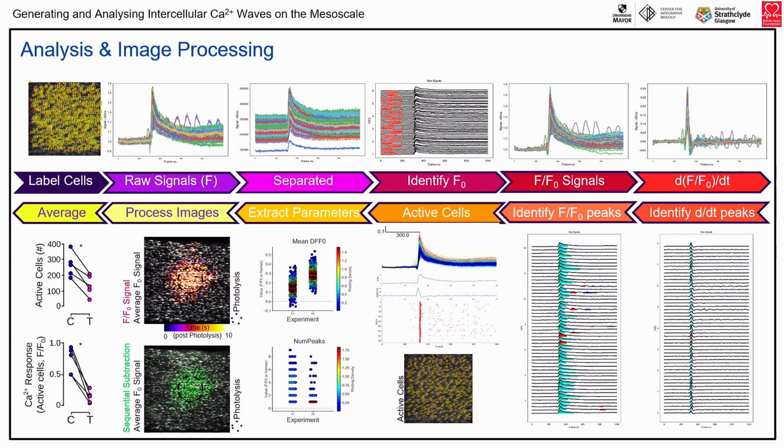So with these techniques, we can look at thousands of cells from the same preparation and analyze the signals really rapidly. All of this software is being put together with a nice user interface. It's going to be published soon and be open source. It's called CalTracker, so look out for that soon.